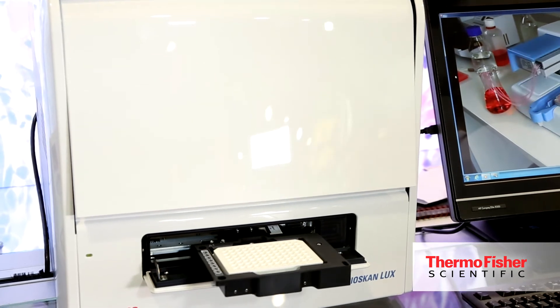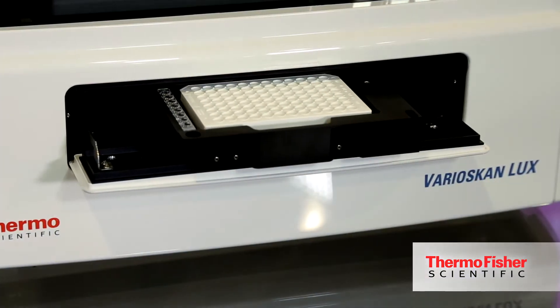This instrument has five different measurement technologies that the customer can use. It's able to accommodate absorbance, fluorescence, time-resolved fluorescence, luminescence, and AlphaScreen technologies. So it covers a wide range of different assays that customers may need to use in their lab.